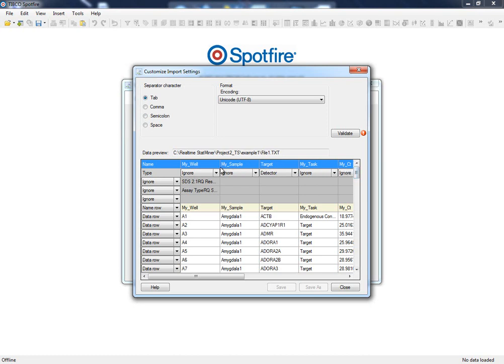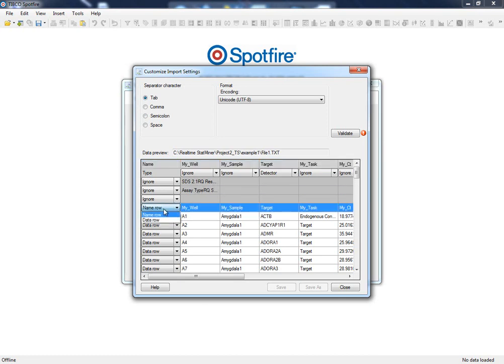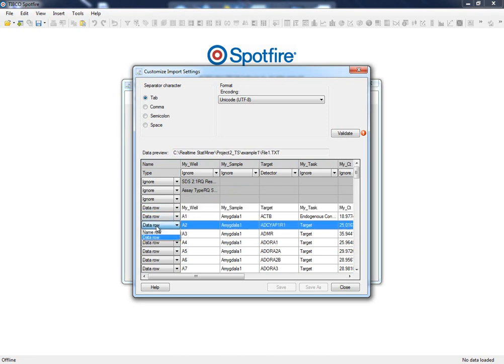Once the header has been skipped, the column names will be highlighted in blue. In case StatMiner is unable to automatically determine where the data block starts, we can select the name row manually. Every row above this will be ignored.